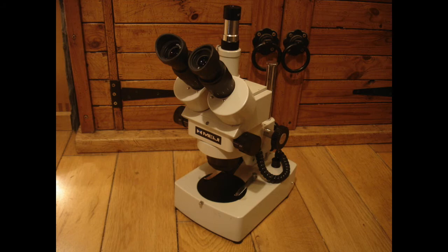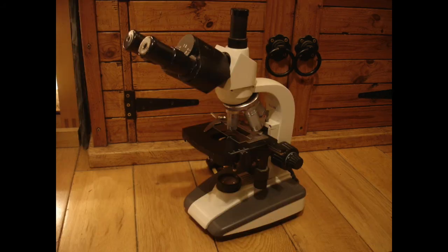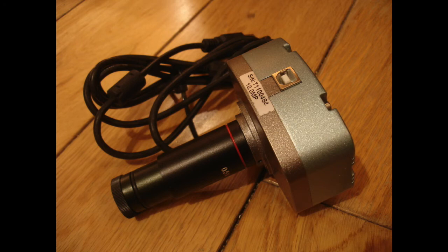Again, this is a stereo microscope — trinocular — for looking at bigger objects like fossils, coins, and bits of archaeology. And this is my compound microscope. All the images you're going to see in this clip are done under a compound microscope. I'll probably do some stereo microscope videos as well, but this one is for looking at things like slides and microorganisms. This is just a quick close-up of the camera I use — ten megapixels.